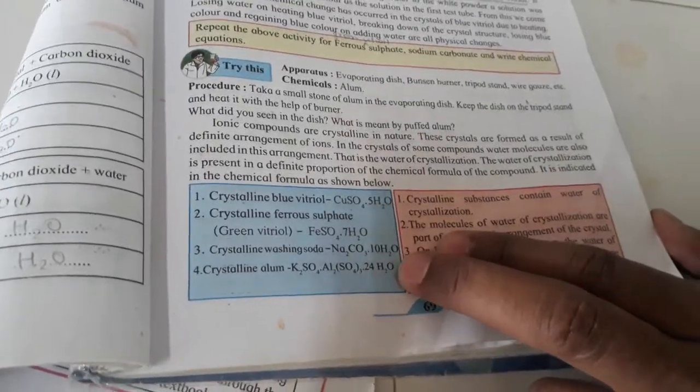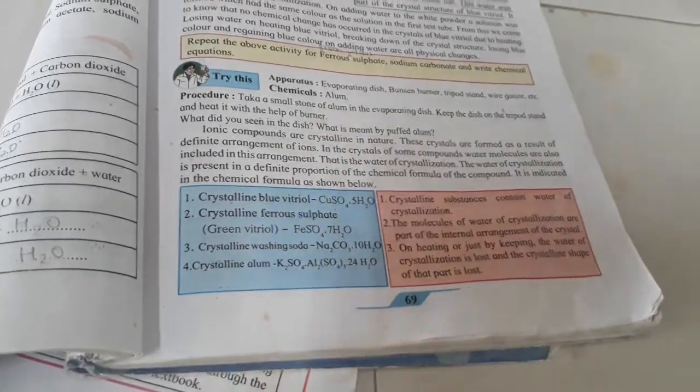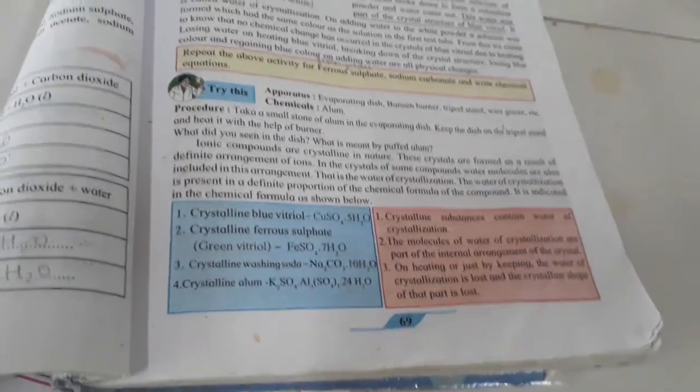24 molecules of water are present in this, meaning compared to other substances, alum is containing more water of crystallization.